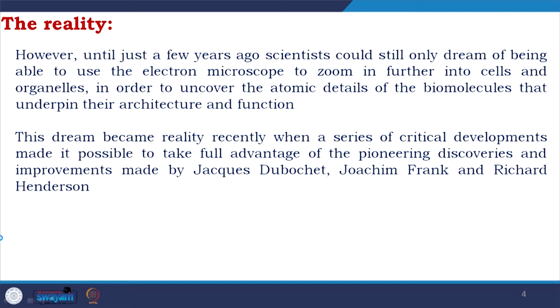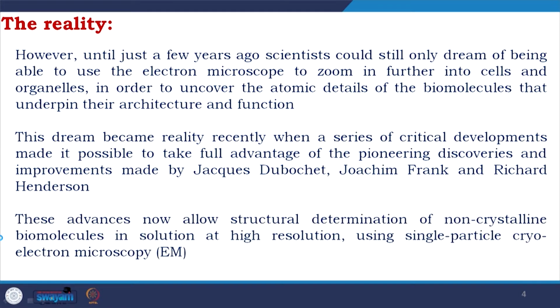This dream became reality recently when a series of critical developments made it possible to take full advantage of the pioneering discoveries and improvements made by the Nobel laureates Jacques Dubochet, Joachim Frank, and Richard Henderson. We talked about them, and we will talk about them in further detail while going through the story. These advances now allow structure determination of non-crystalline biomolecules in solution at high resolution using single particle cryo-electron microscopy.